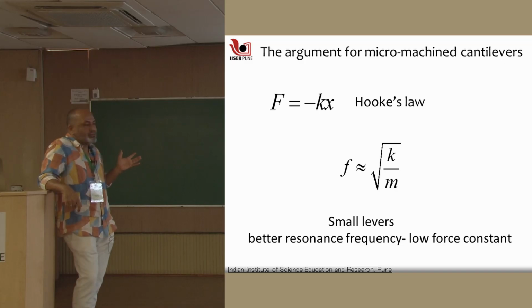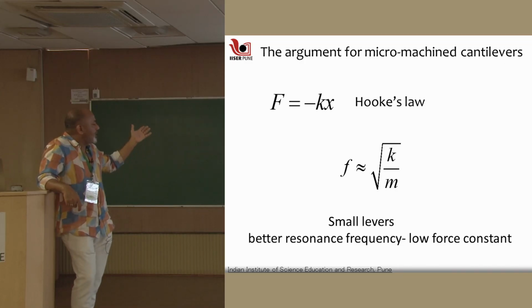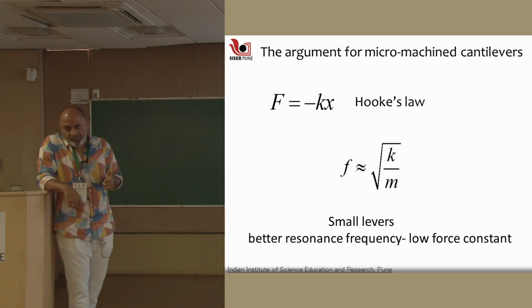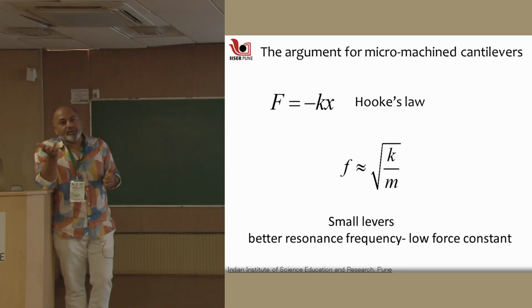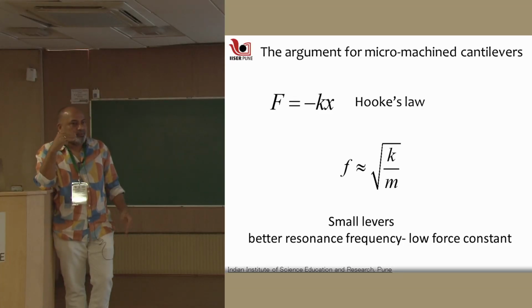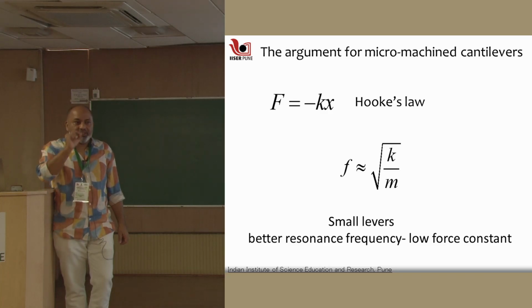And how weak? Roughly one can say from Hooke's law, which is what we are doing right now: if I have 1 nanonewton of force, and let's say through interferometry, through some optical detection technique, which is technologically quite high end, I am able to somehow measure stretch or bending of the spring of the order of 1 nanometer.